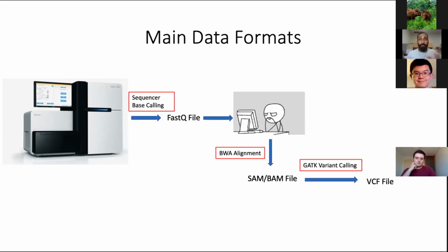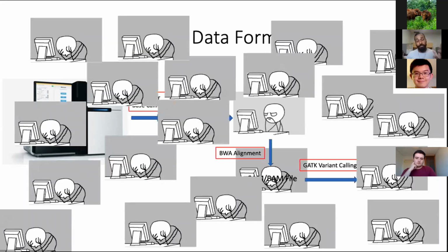This might seem very straightforward, and if you just look at this little diagram that I did, it seems like a very short procedure. But like any experiment, most of the time we end up looking like this, because you're going to encounter errors, and the errors are going to keep coming, and you're not going to know why the error is there. You're going to have to do research and read literature to figure out why the program is not moving forward.